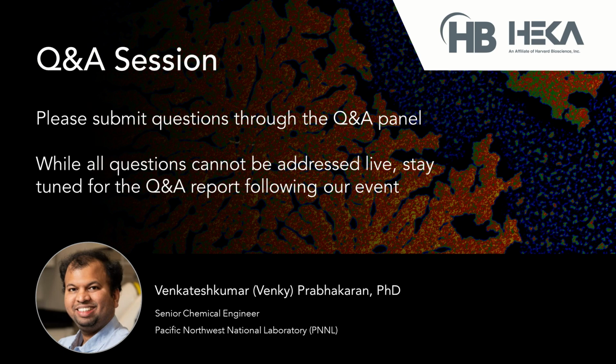Again, we believe that is probably still to do with the micro humidity changes going on around the tip, because the impedance is very sensitive to that part of it. For example, any micro precipitation that forms around the tip could affect the impedance response. So that's one of the challenges we are still facing: to control or stabilize the precipitate formation at the tip, especially when you use a salt solution. So I think that's one of the reasons it's not well correlated with the microstructures.